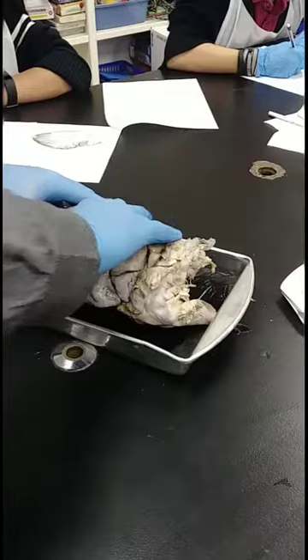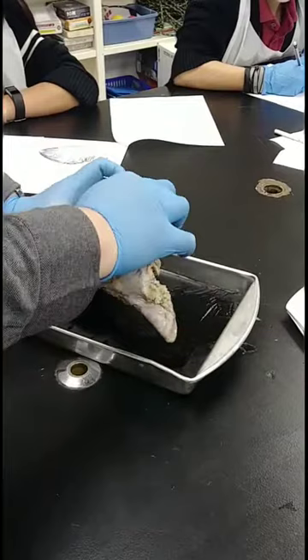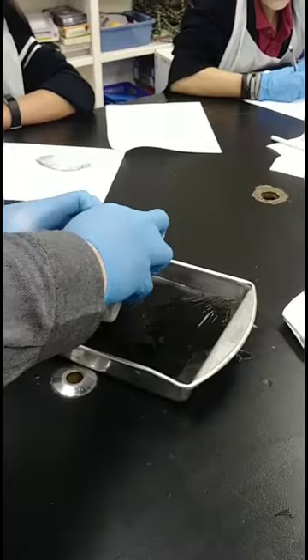Follow step one. You have a big aorta complex up here. This covers the atrium. It's an auricle. And this big, thick structure here is the aorta coming out of the top of the heart, going all the way up to here. All right?